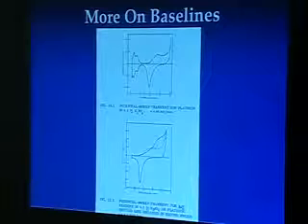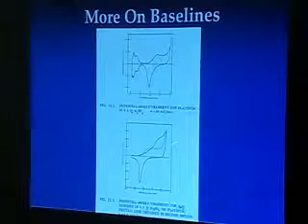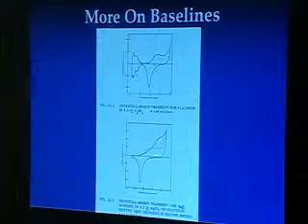Now, obviously, in this case, you don't even have to do that. It's not going to take anybody too much time to figure out that this cyclic voltammogram is different from this one over here, and that something's happening. But sometimes the chemisorption is much more subtle.